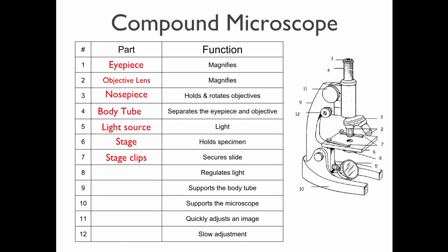Oh, I'm so excited. And the mechanical stage is pretty cool. So the mechanical stage, rather than just clips, has this little thing here. Because on those microscopes, in order to move the slide and look at different parts of it, you basically just move the slide with your fingers, like this. And sometimes, if you're under high power especially, you try to move it a little, but it goes flying off, you can't see anything.